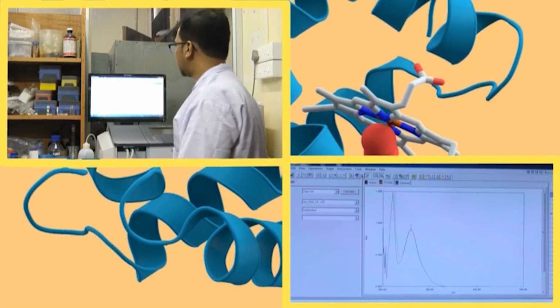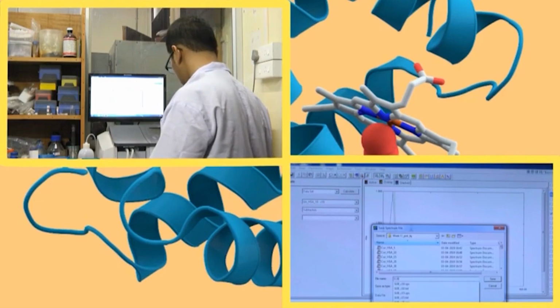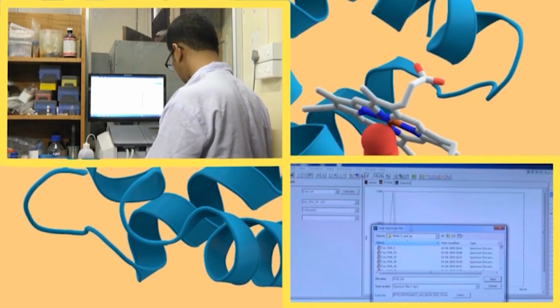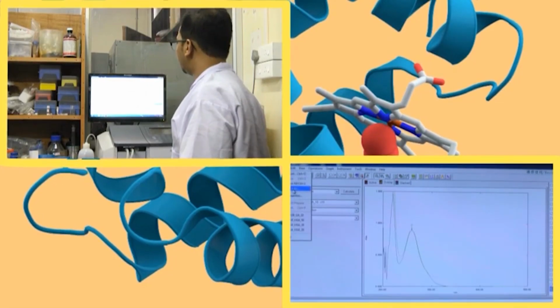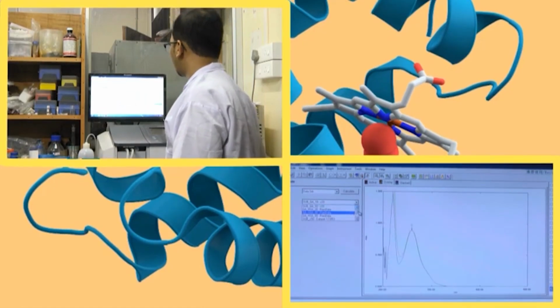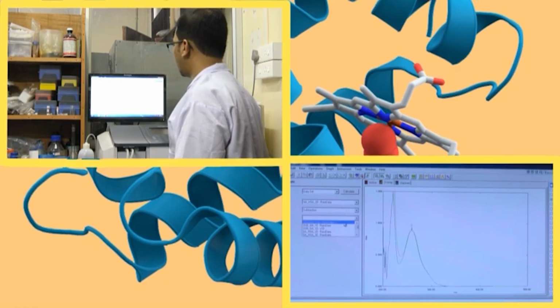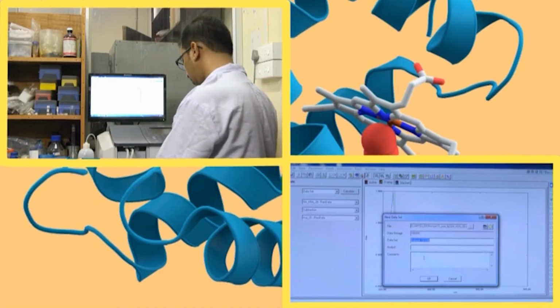I will go into details about the changed spectra after a few minutes. I am saving it as SUB GA 10. So, for 10 micromolar of HSA, this is a change, and again I am saving it in text file. And the next thing I will be doing is taking GA HSA 20 and subtracting this one from HSA 20. So, just subtract. So, what I am getting is 20.